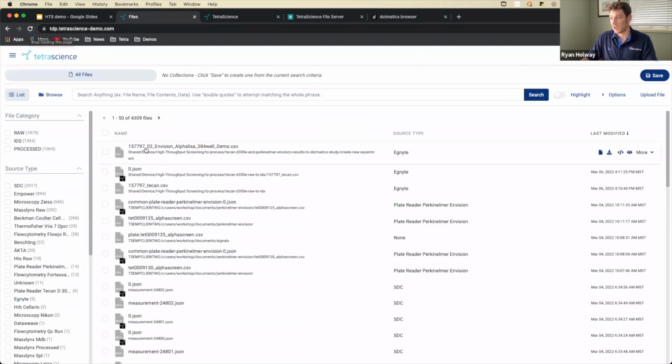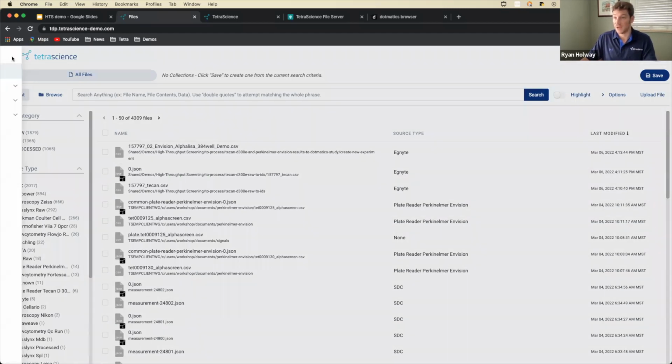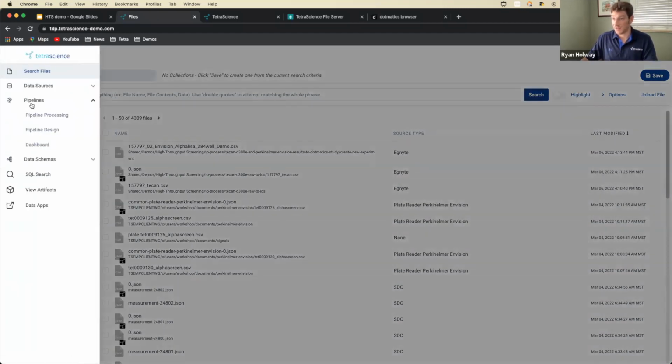Refresh the page and I can see at 4:13 p.m. is when that file drops. So it looks like that just dropped now. And from that file dropping on the platform, it will also trigger a pipeline. So in a similar fashion, we'll take a look at that pipeline.